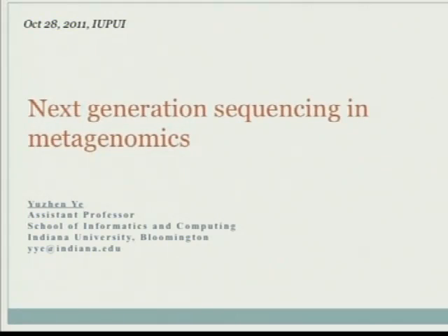I will not talk about the details of the experiments for metagenomics, but I will focus on the computational side. Once we have a huge number of DNA sequences, what we can learn from those sequences about two aspects: the taxonomic composition and also the functional content for a whole community of microbial organisms.